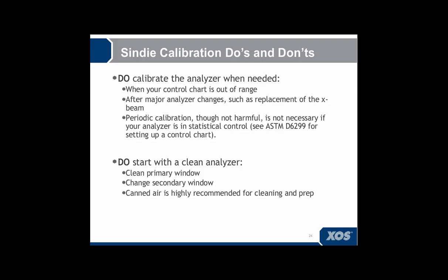If you do need to calibrate your analyzer, make sure you're starting with a clean analyzer. Clean the primary window. Change the secondary window. Again, we highly recommend the use of canned air here.